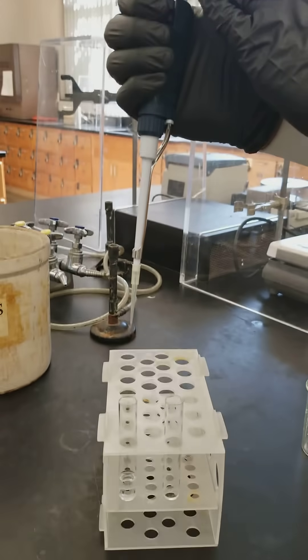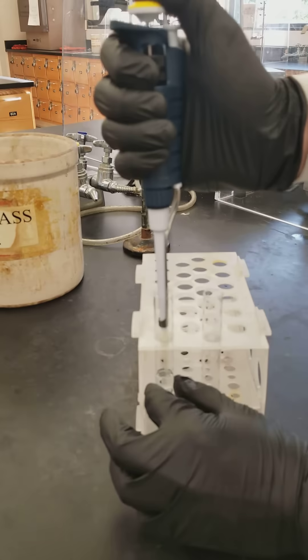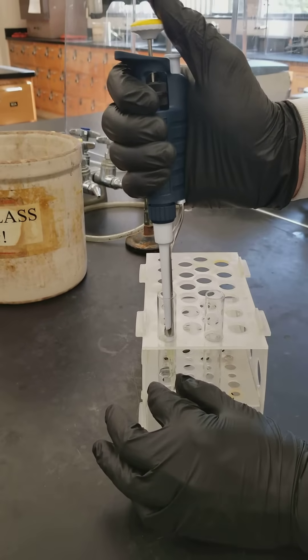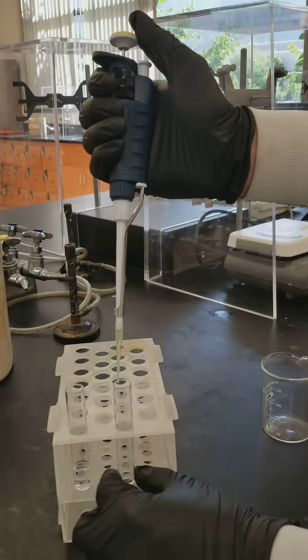Then you need to press down on your plunger to the first stop. Place it into your liquid. Once it's fully submerged, you pull up on your plunger until it stops. Make sure it's fully submerged the entire time, otherwise you'll pull up air instead of your liquid.